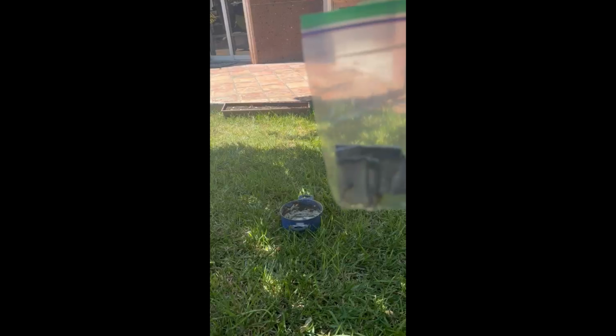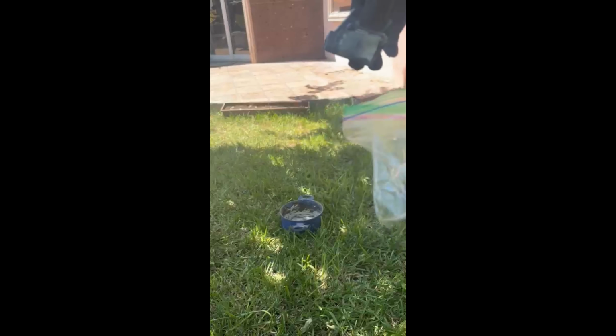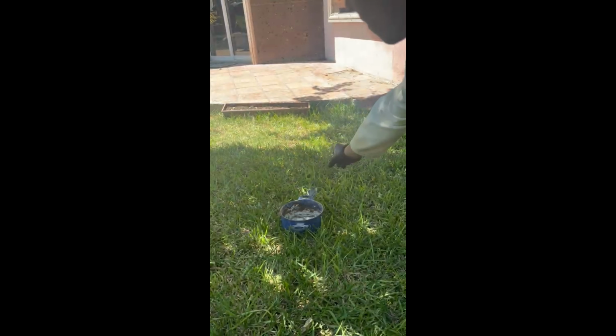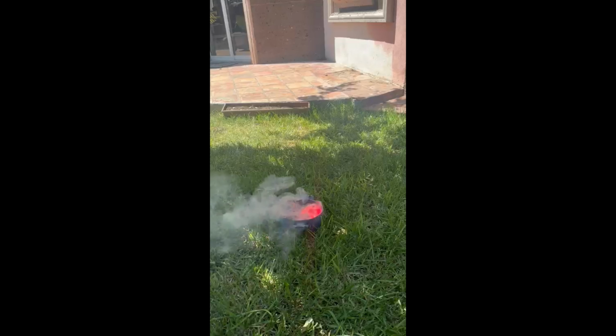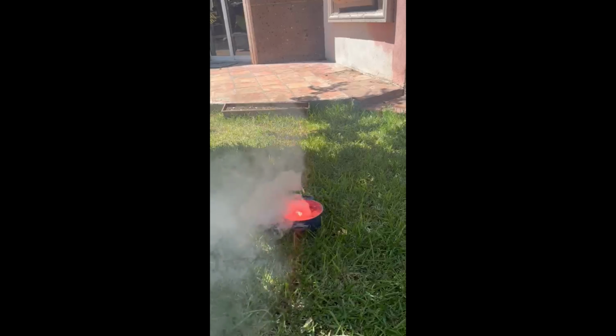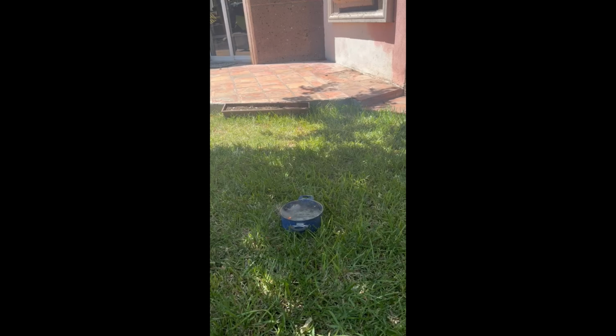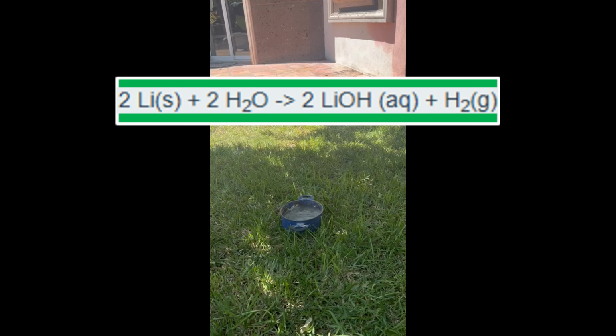I started by throwing it to a casserole full of water. What's happening here is that lithium and water react releasing a lot of heat, also known as an exothermic reaction. As a byproduct, hydrogen gas is formed, which is a flammable gas, so it starts to flame.